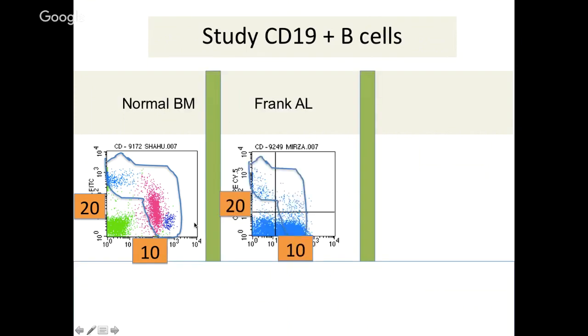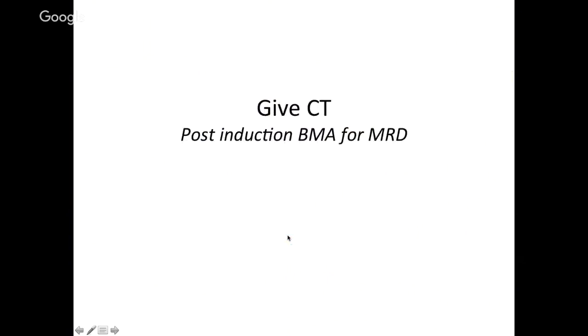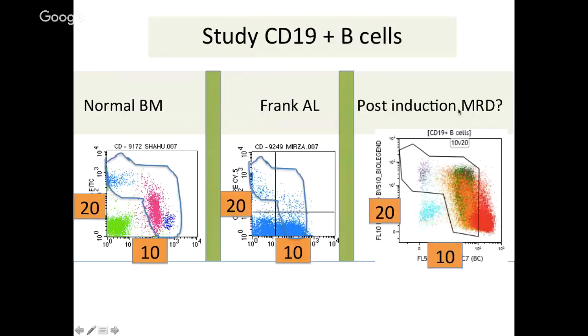Now, this is a case of frank acute leukemia, which we just discussed. And the third case I'm showing you will be post-chemotherapy, like post-induction. Now, this is the third slide, the same case which was given chemotherapy. And you see a lot of dots, a lot of events coming out of this template. So this is your MRD.